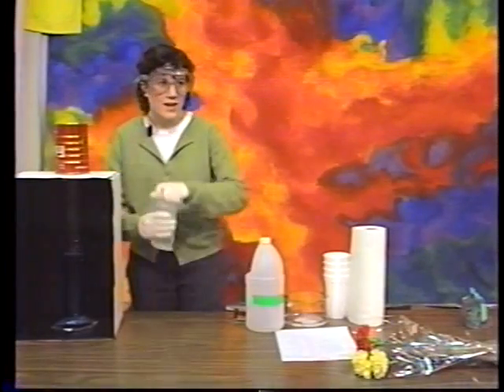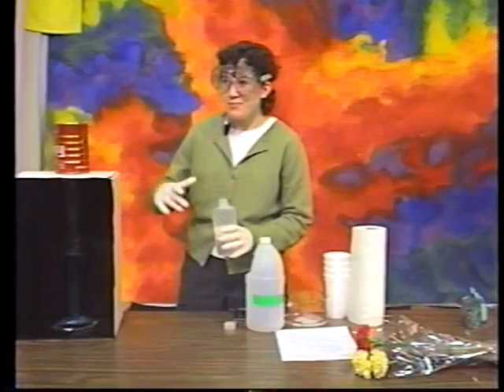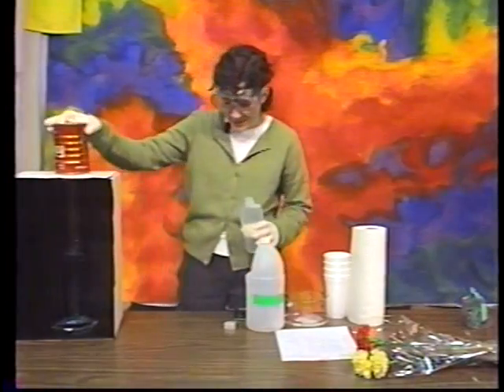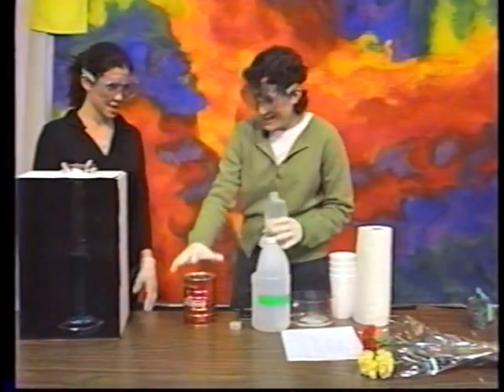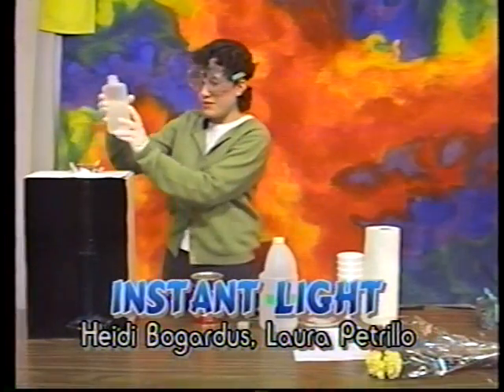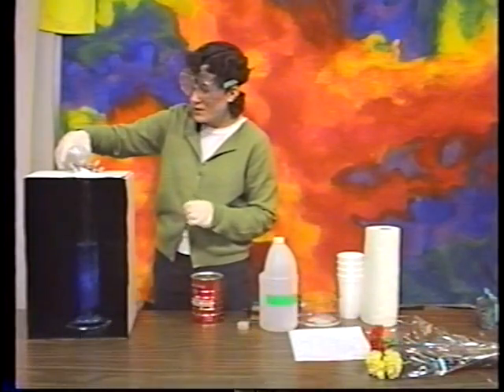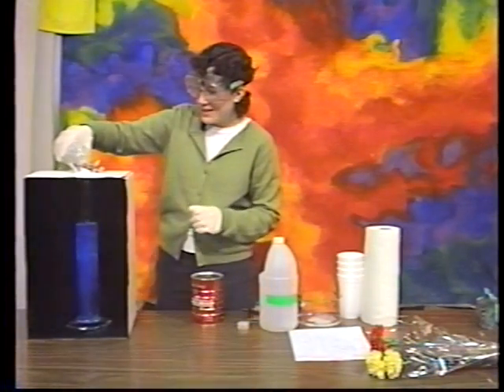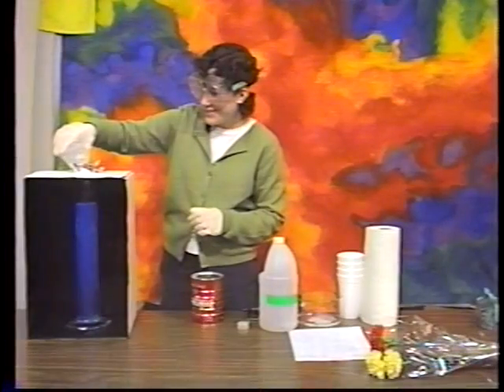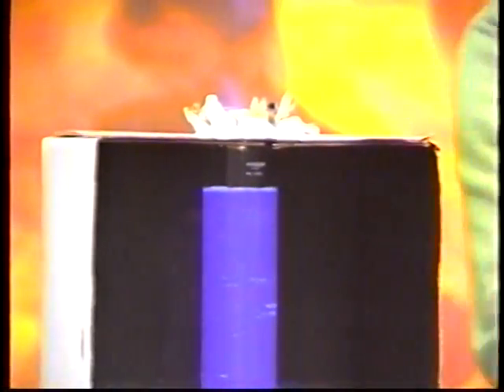Heidi, you're on. Okay, we're going to have an experiment here. It's called chemiluminescence because, well, you'll see why it happens. So we're going to just pour this. This is some peroxide, and we're just going to pour it into here, which has some solution. Is it working? Yep. Okay. As you can see, the solution is glowing by itself.